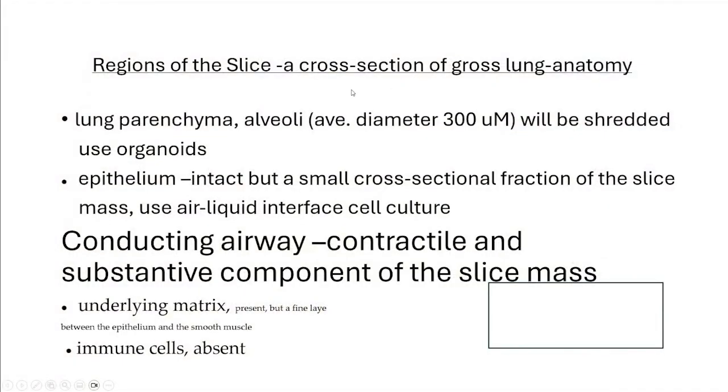Okay, so the regions of a slice have a cross-sectional of gross lung anatomy. You'll have, as I said, lung parenchyma, just to summarize, that will be shredded. If you want to study alveoli, you will use organoids, not slices. So you'll use a different experimental model.